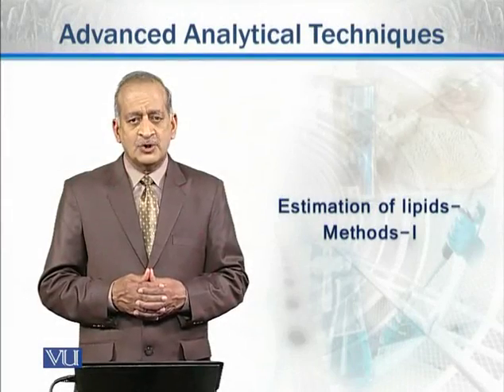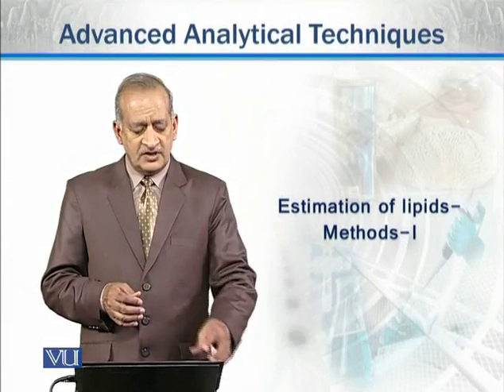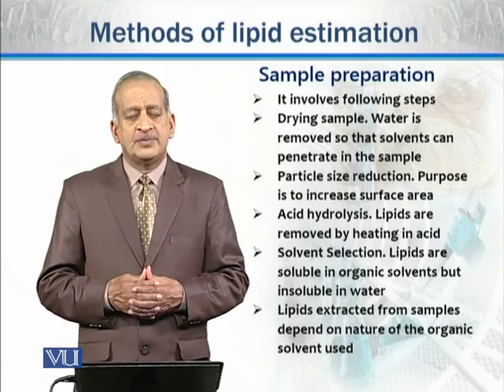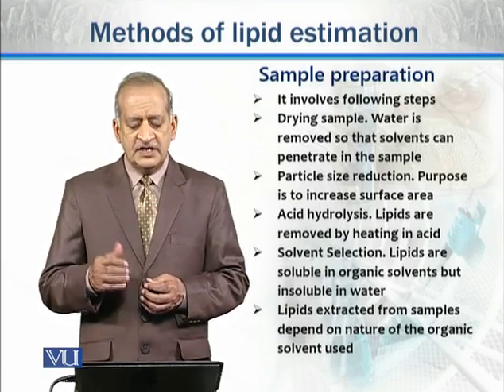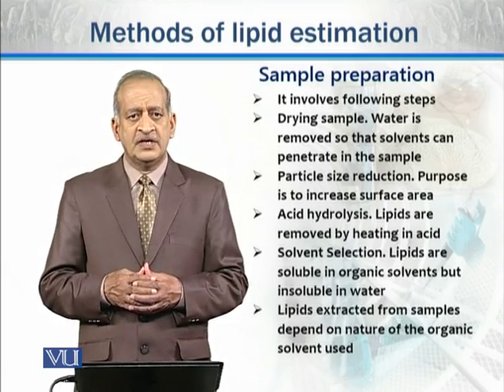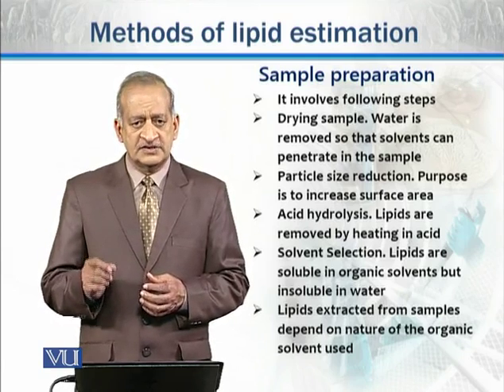Okay, our next subtopic is method of estimation of lipids. So first part of methods. First of all, we'll discuss sample preparation, how we will prepare sample for estimation of lipids. It involves different steps. First step is drying of sample. In this step, water is removed from the sample.